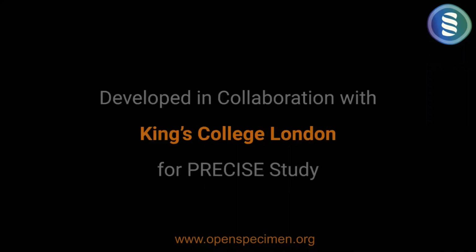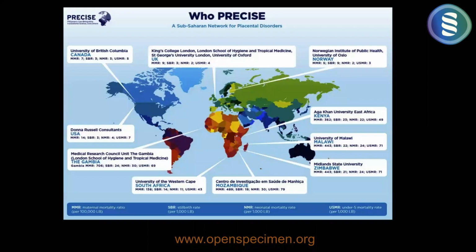This app was initially developed in collaboration with one of our clients, King's College London, for a study called Precise. This is a pregnancy study done in multiple countries, primarily in Africa, such as Gambia, Mozambique, Zimbabwe, Kenya, etc. The study is funded by two centers, University of British Columbia and King's College London.